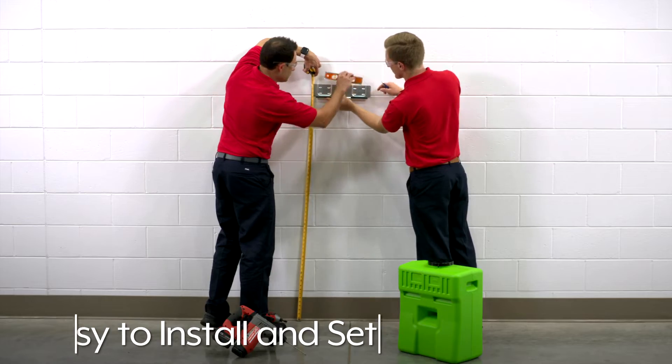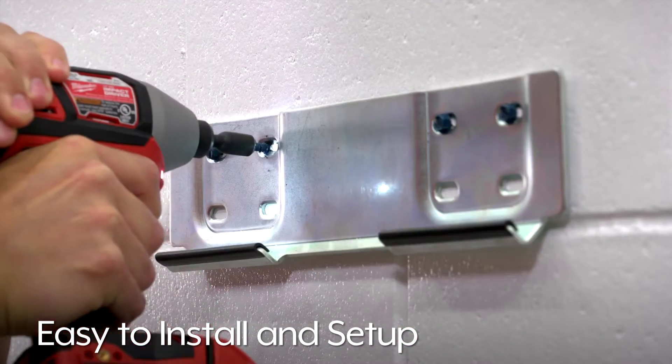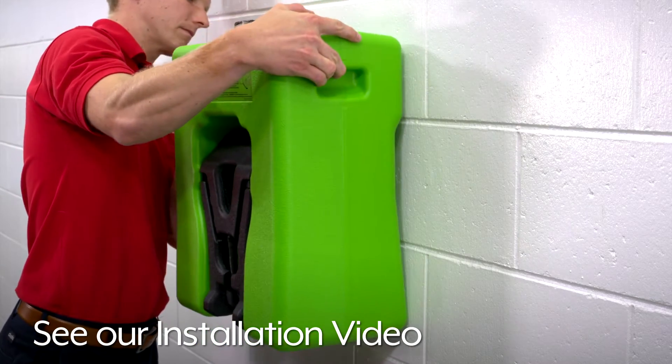The Slim Flow Eyewash Station is easy to install and set up. For installation instructions, please see our installation video.